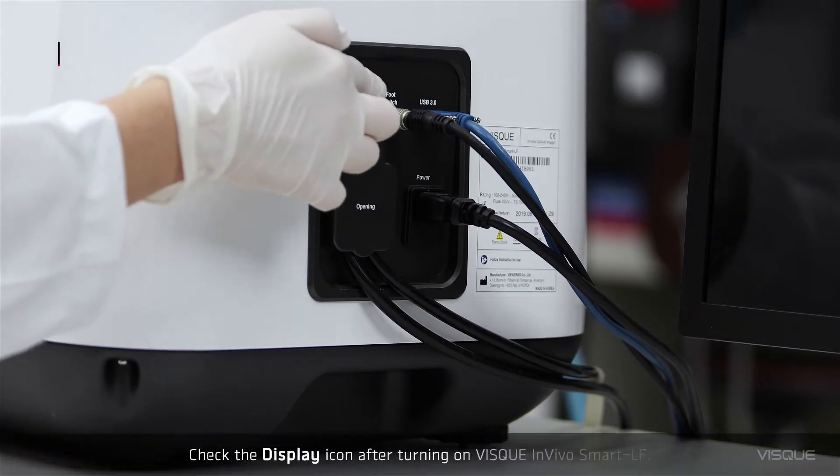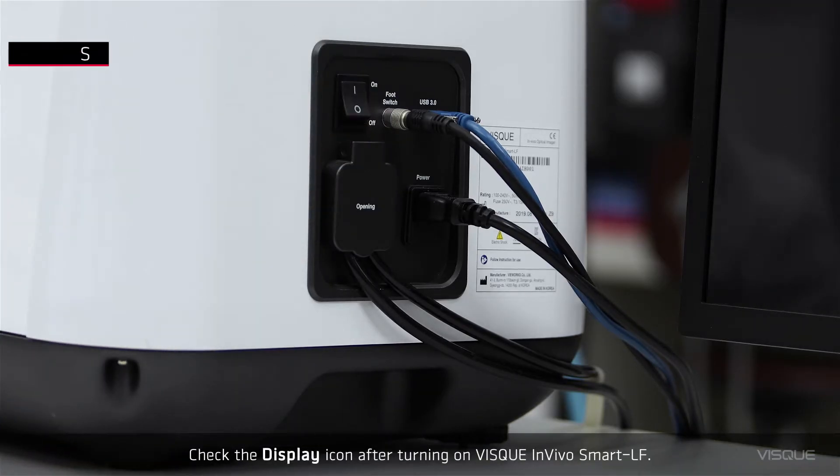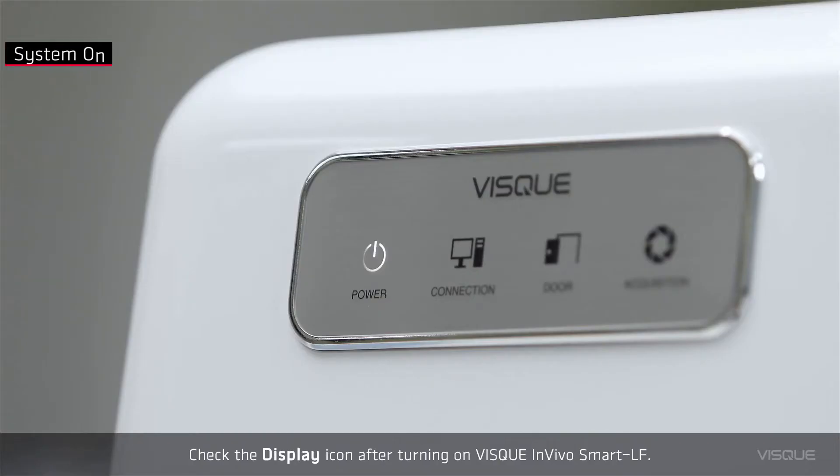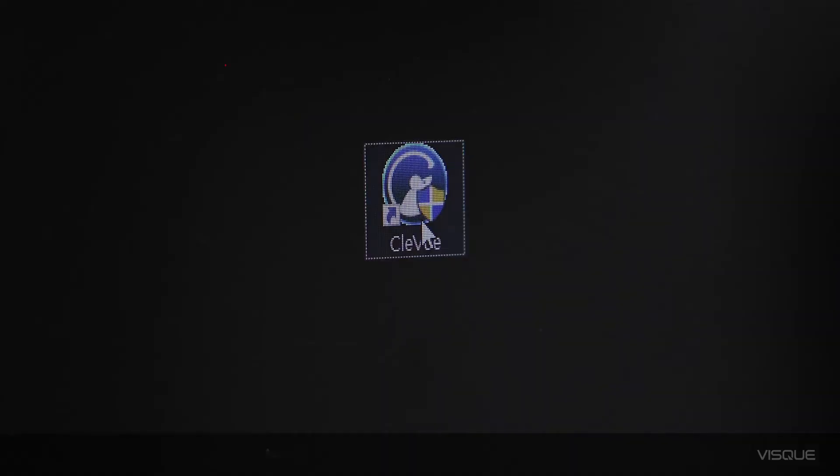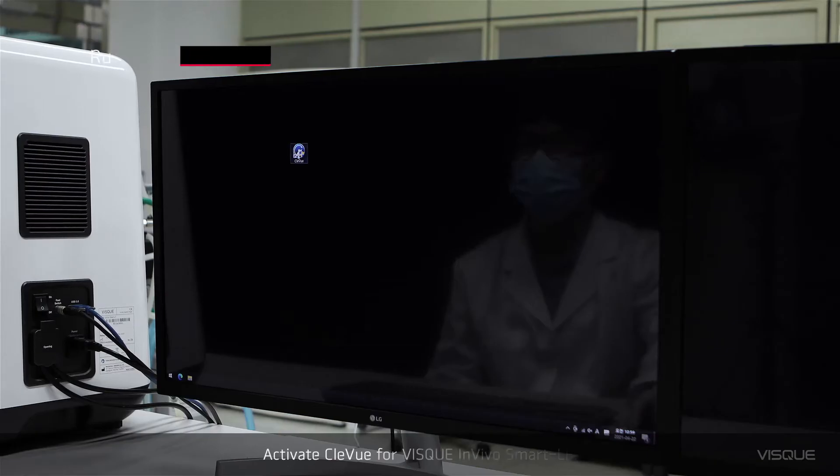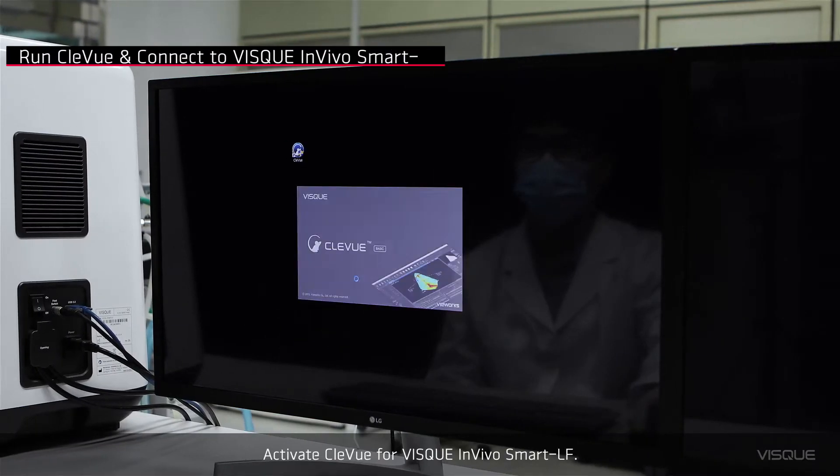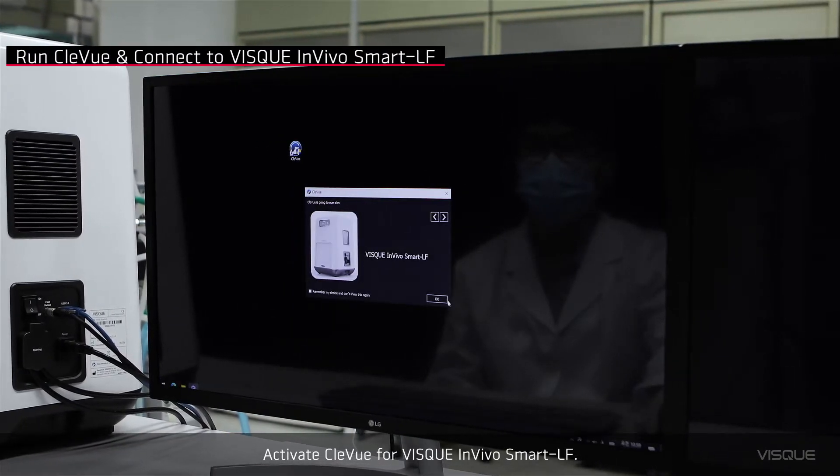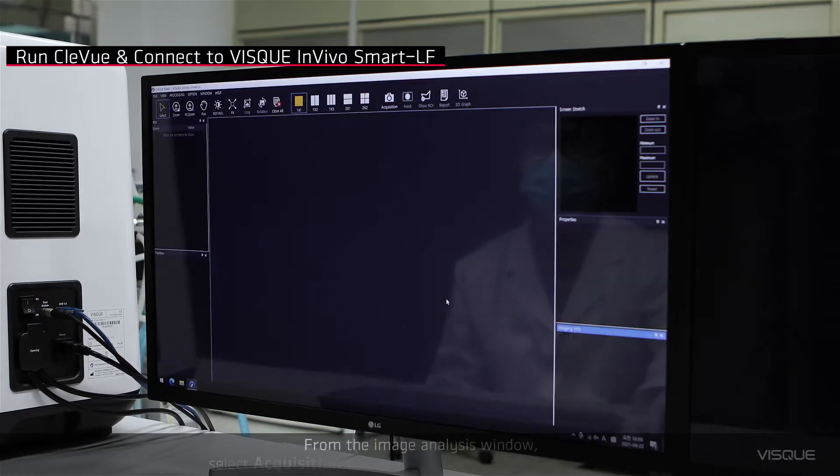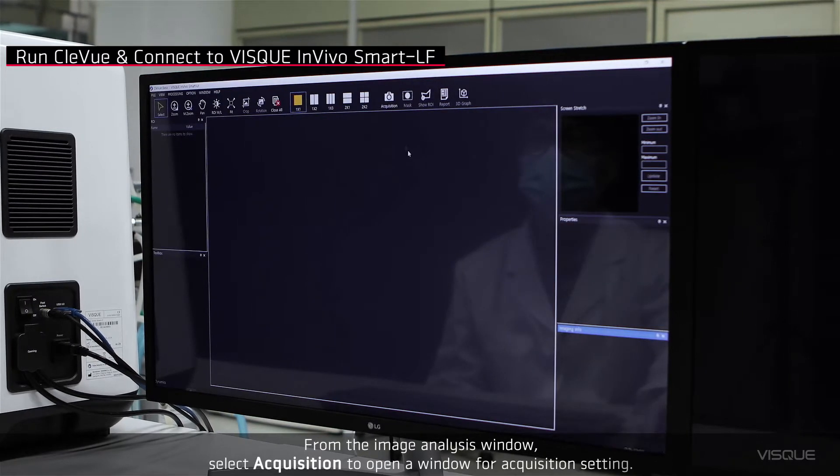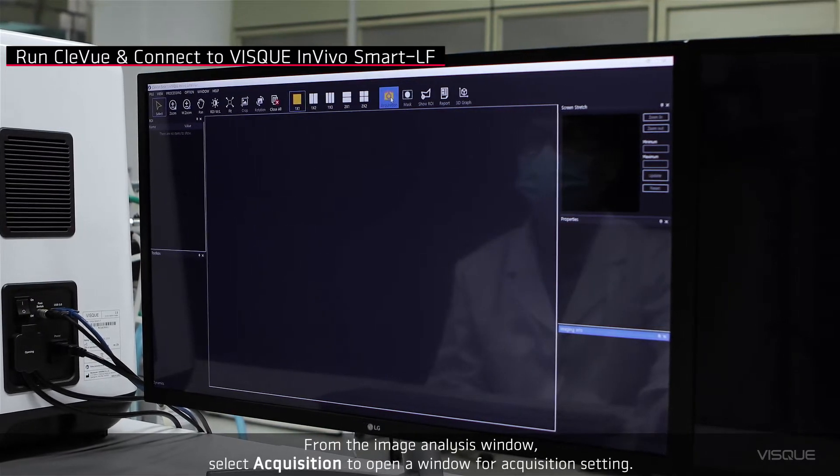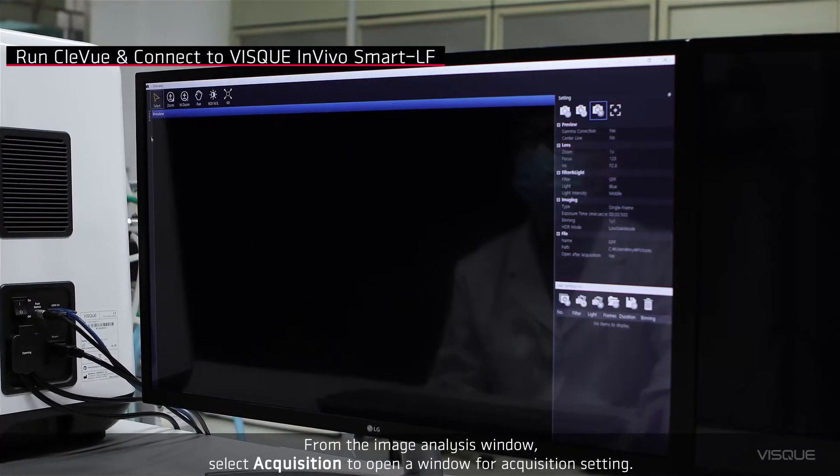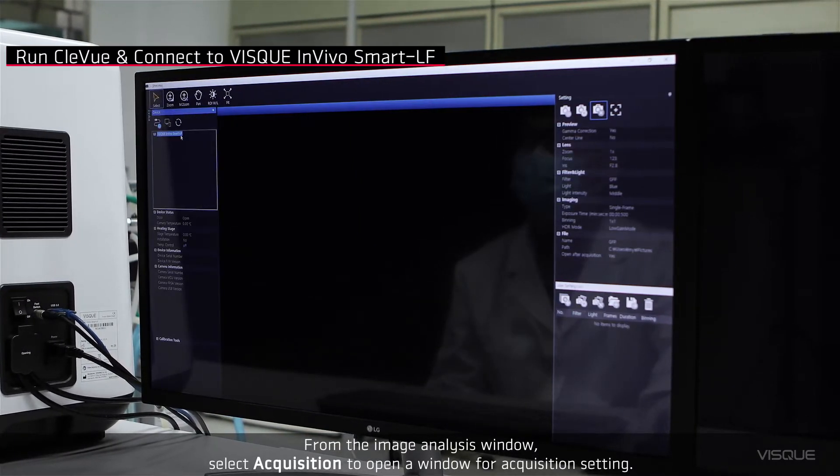Check the display icon after turning on ViSQUE InVivo Smart LF. Activate CleView for ViSQUE InVivo Smart LF. From the Image Analysis window, select Acquisition to open a window for acquisition setting.